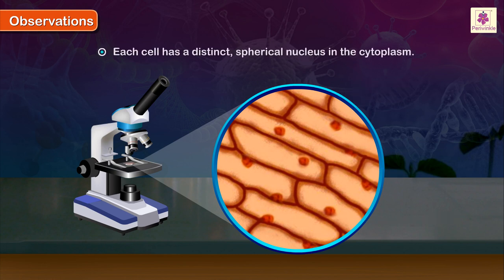Each cell has a distinct spherical nucleus in the cytoplasm. A large central vacuole is seen in every cell. No intercellular space is seen.